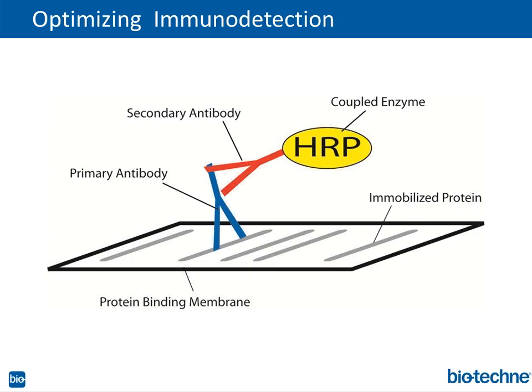The Fc regions can be a little sticky, because there are a lot of hydrophobic domains there. So the Tween in TBST is necessary, but I've actually seen some papers, believe it or not, that removed the Tween because it was starting to scrub off some of the proteins. But generally, people use TBST.